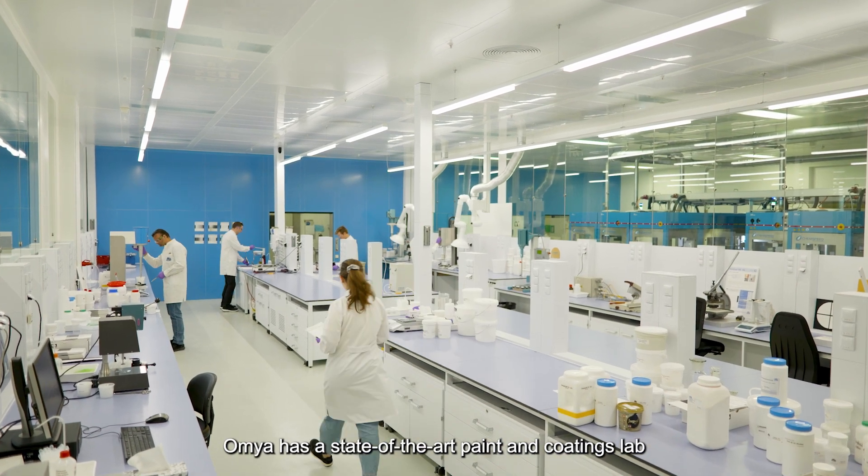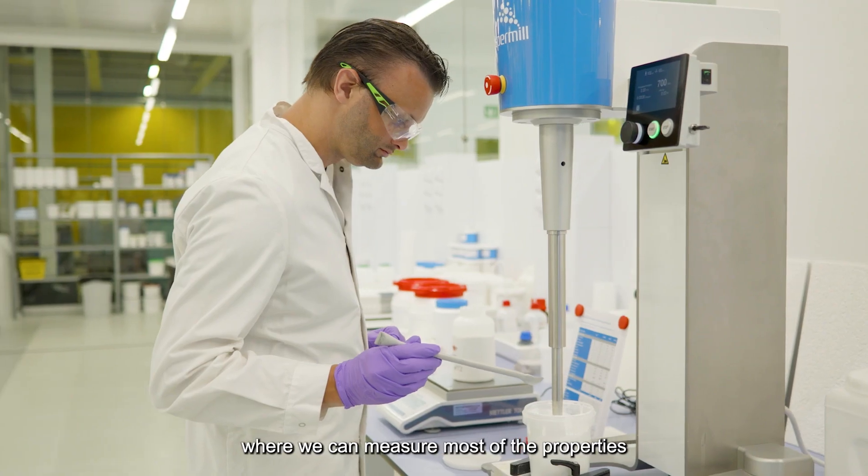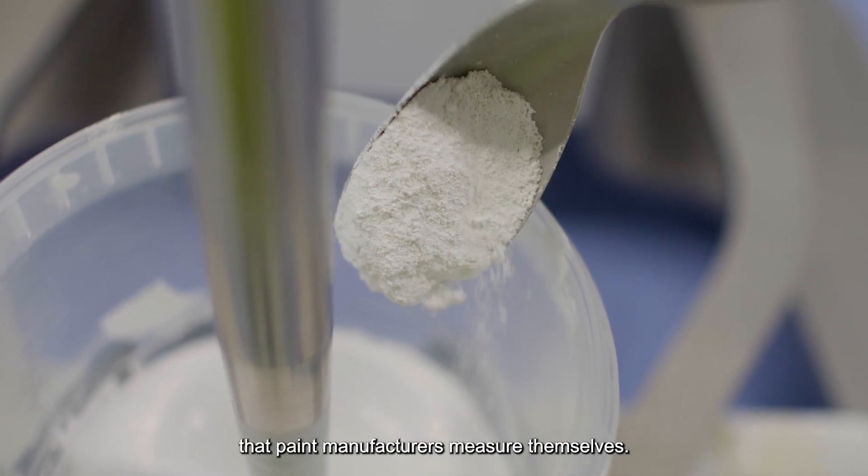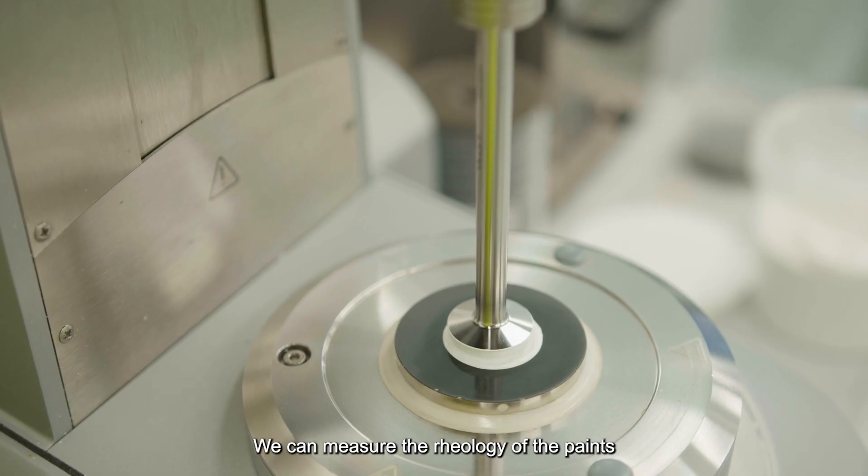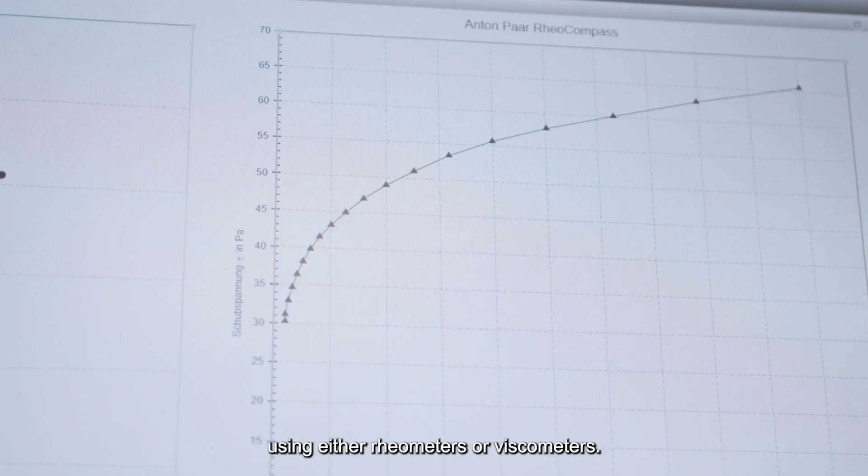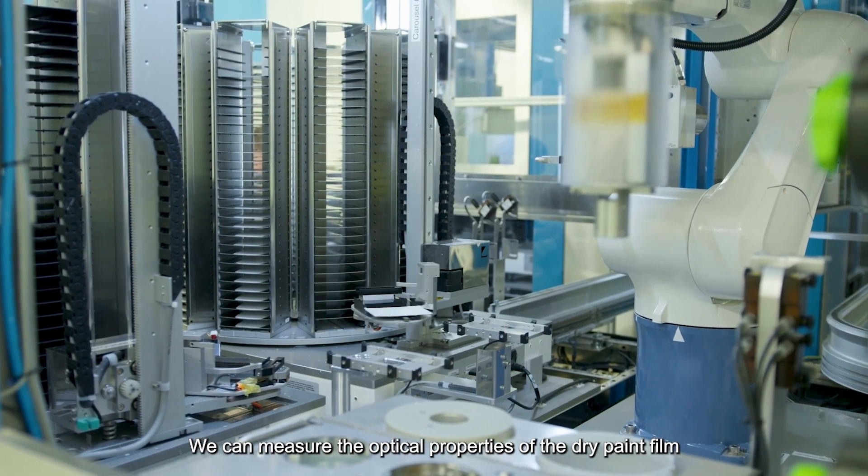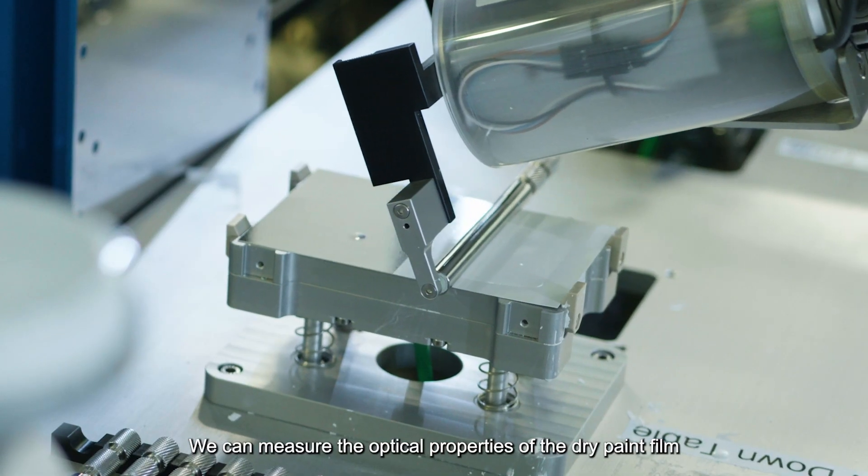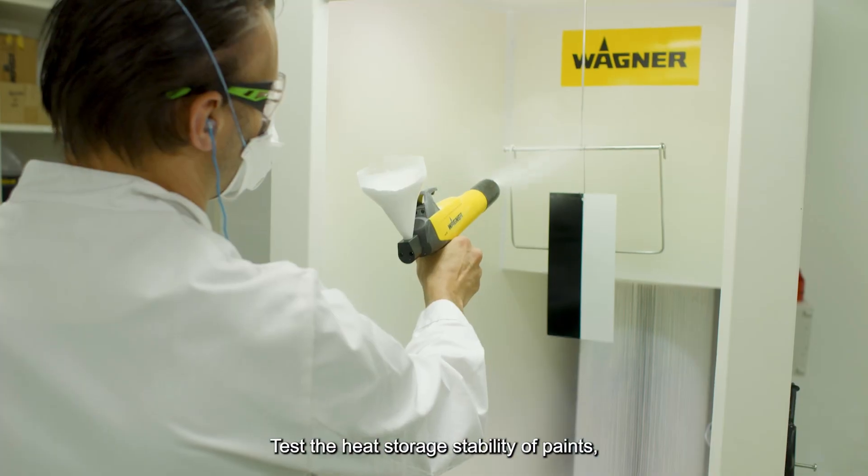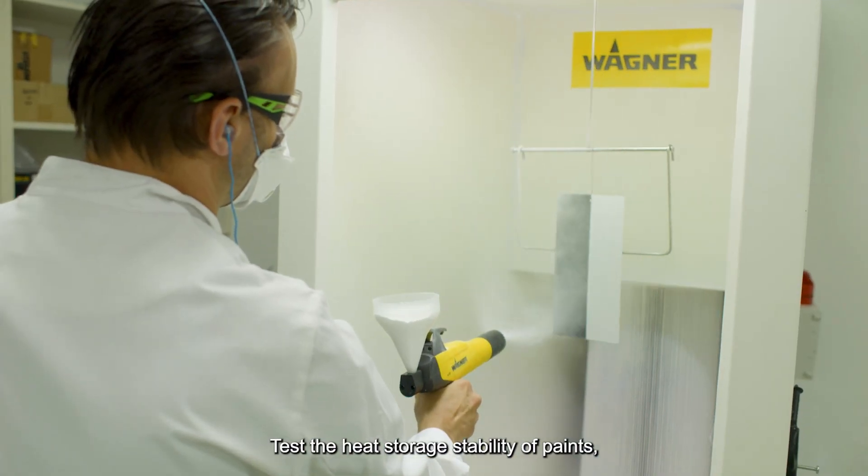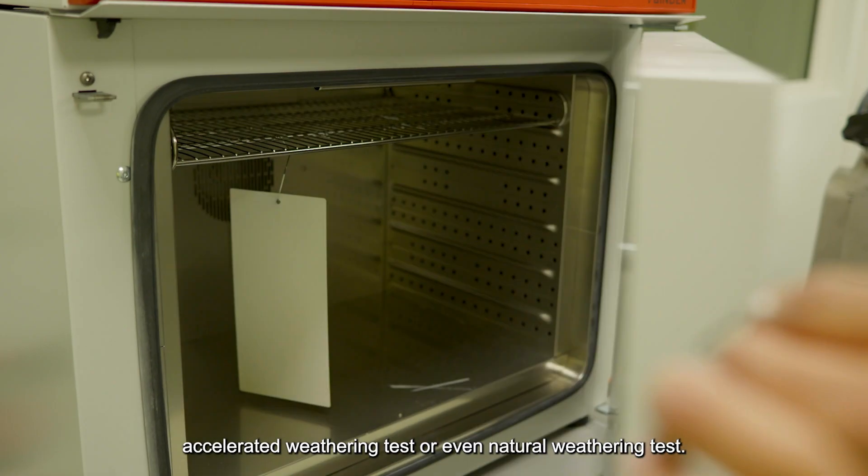OMIA has a state-of-the-art paint and coatings lab where we can measure most of the properties that paint manufacturers measure themselves. We can measure the rheology of the paints using either rheometers or viscometers, measure the optical properties of the dry paint film that we have applied in a drawdown, test the heat storage stability of paints, accelerated weathering tests, or even natural weathering tests.